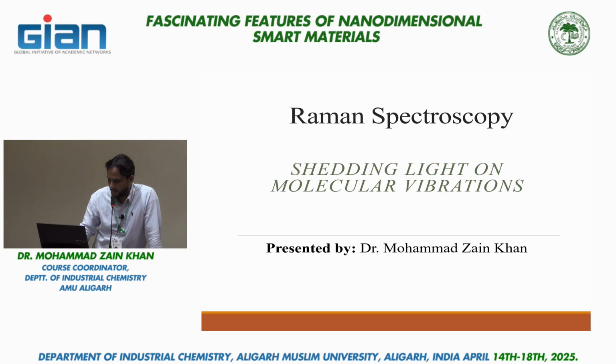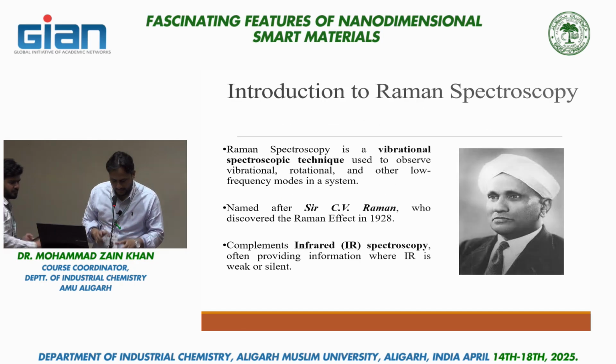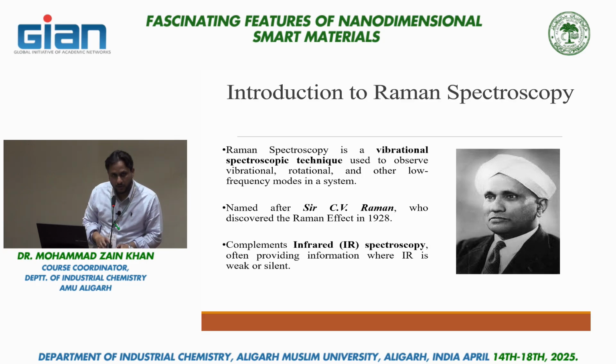The Raman spectroscopy. Raman spectroscopy, as I said, is a complementary technique which completes the IR technique, especially for those molecules which do not have a permanent dipole moment and which are IR inactive. They can be studied via Raman spectroscopy.